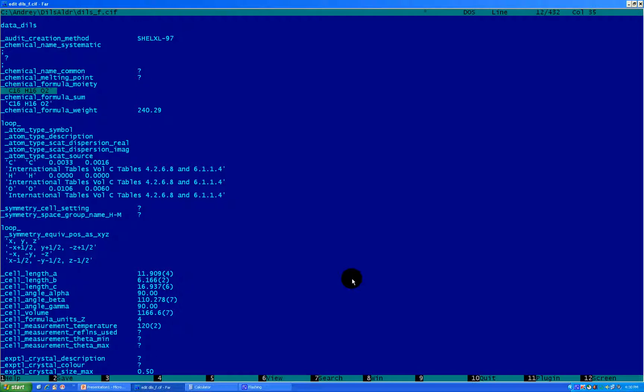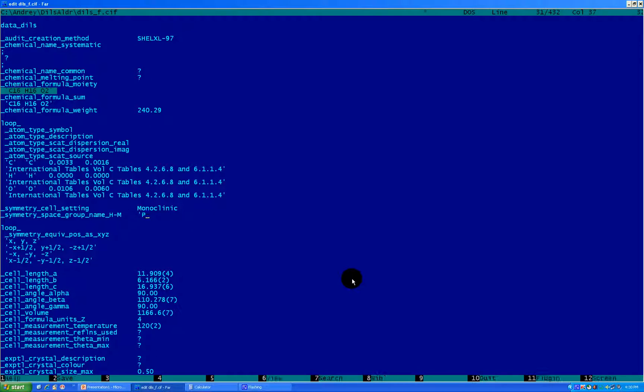Well, the next question mark will be symmetry cell settings. And we know the space group is P21/n. So this corresponds to monoclinic space group. And since it's monoclinic space group, that's what you need to write. So it would be monoclinic. Okay, I'm going next. Symmetry space group name - as we told it, it's P21/n. So P2 - let's space it - P21/n.